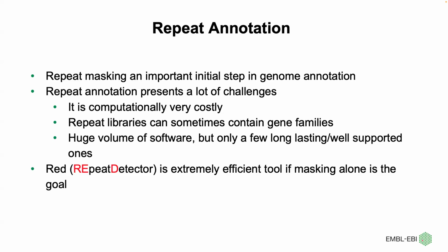So we need to run BLAST against the gene families so that the repeats are the actual repeats. And identifying repeats in general is complicated as these are poorly conserved. The boundaries of repeats are sometimes not very well defined. And sometimes repeats can also insert within other repeats, and therefore accurate detection of these repeats requires generating these repeat libraries for any species that you want to annotate.